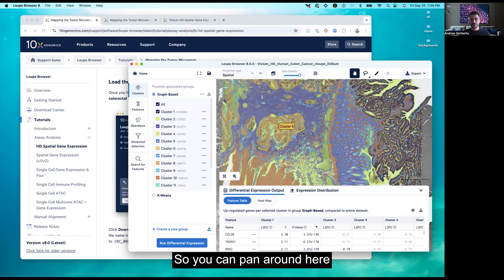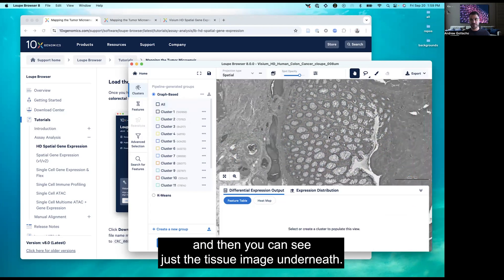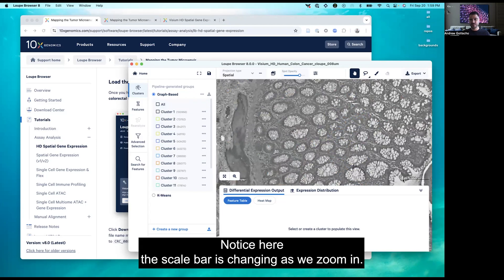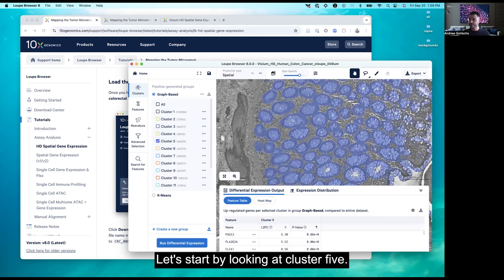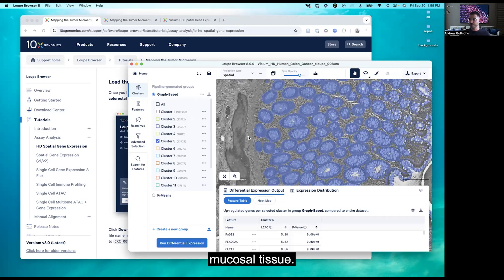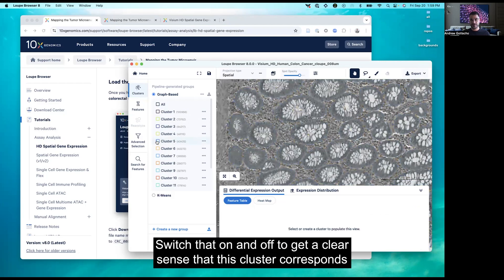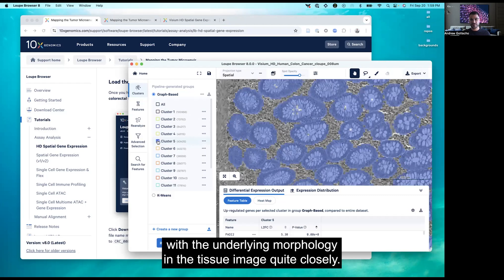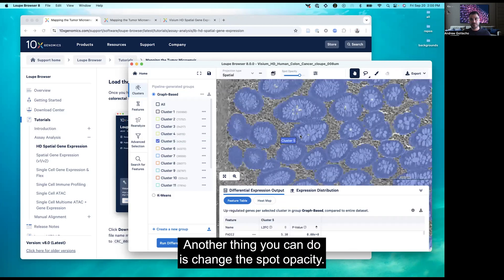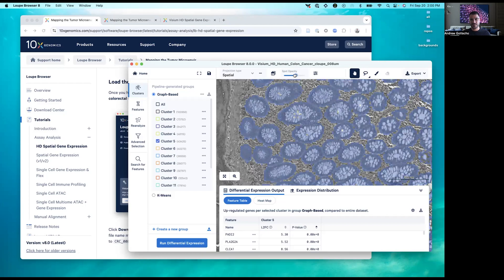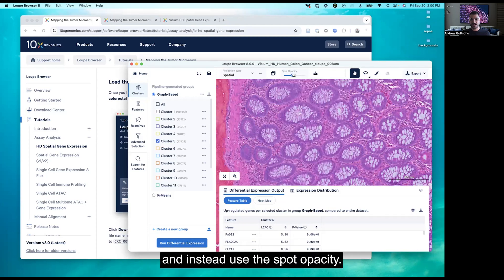You can pan around and zoom in further. You can uncheck all to see just the tissue image underneath. Notice the scale bar changes as we zoom in. Let's start by looking at cluster five, which corresponds to glands of normal colon mucosal tissue. Zoom in further and switch it on and off to get a clear sense that this cluster corresponds closely with the underlying morphology. Another thing you can do is change the spot opacity — go back to your projection settings, turn the saturation back up to normal, and use the spot opacity control.